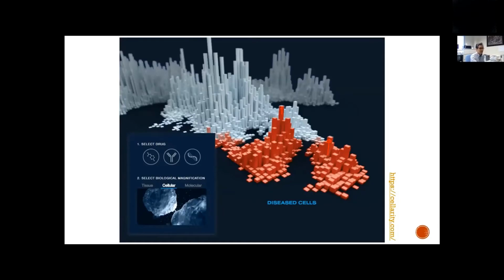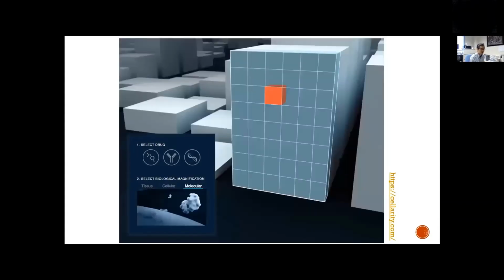All right, so let's just give you some concept. You can zoom in and see particular signals and compare in high resolution, up to a single individual cell compared to its neighbors. You can still zoom in because each individual cell has many different expressed genes. So you can look at different genes' expression. This is just a cartoon and not very accurate, but it gives you a global impression of what's going on here.